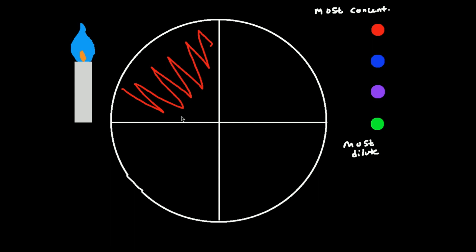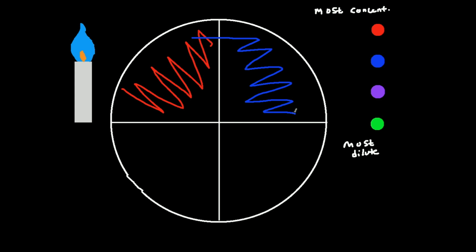Now I'm going to stick my loop back in the flame and sterilize it again. Then what I'm going to do is drag my loop through a small portion of where I streaked in the previous quadrant — just through a small part, not a big part — and then zigzag in the next quadrant like that.